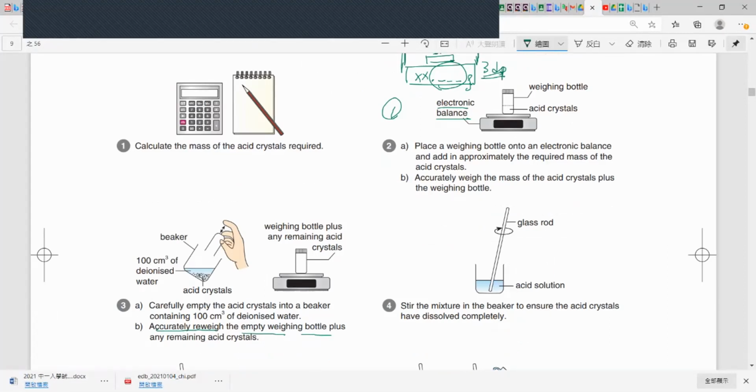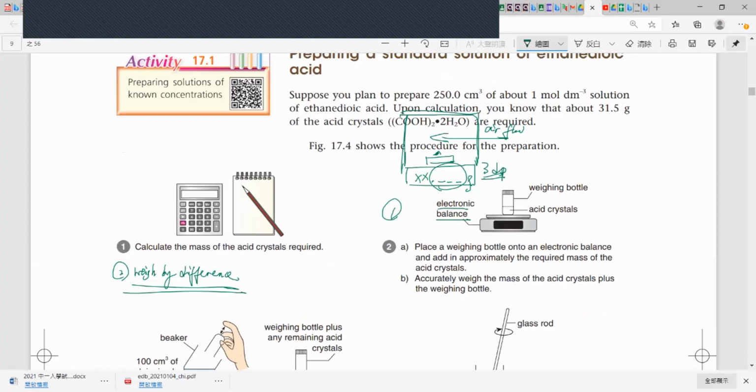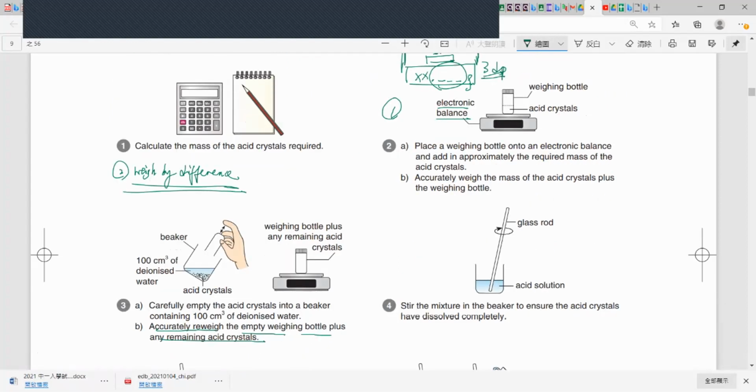Accurately we weigh the empty weighing bottle plus the remaining acid. 咩意思啊？佢做緊啲咩動作？呢個係準嘅動作，係做啲咩啊？Weigh by difference。嗱，weigh by difference 係第二個 technique 嚟嘅。點解咧？咁唔係攞個吉嘅樽稱，跟住就倒啲鹽落去，咁就收工咯。跟住我倒啲鹽，即係2個讀數啫嘛，咁我咪計完咯。咁點解仲要再稱多次咧？因為可能有啲剩喺嗰度。係啊，有啲剩㗎。Any remaining acid crystal, they are still found inside.